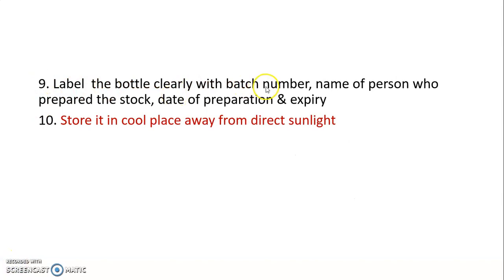Label the bottle clearly with the batch number, the name of the person who prepared the stock, the date of preparation, and the date of expiration. Store it in a cool place away from direct sunlight.